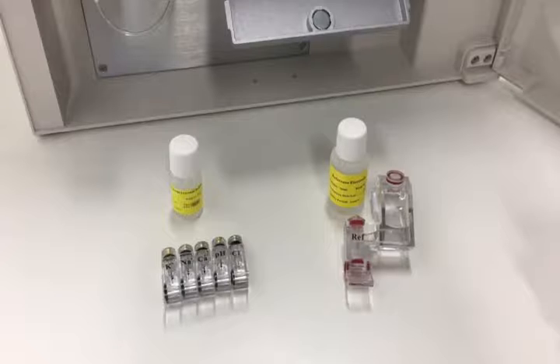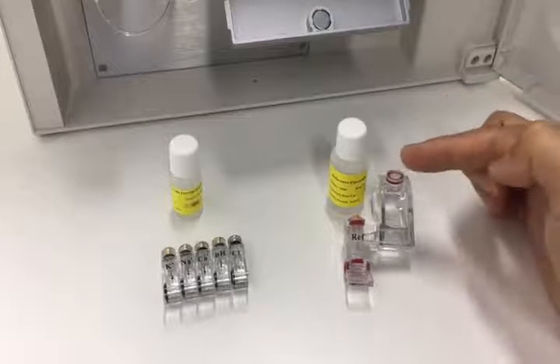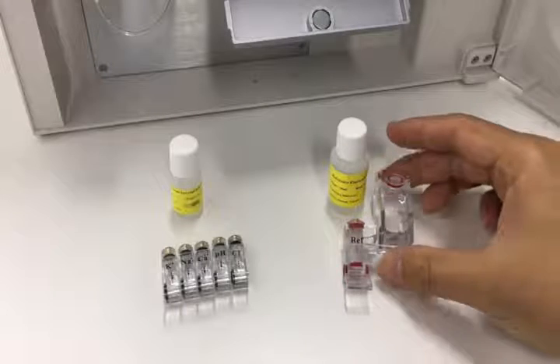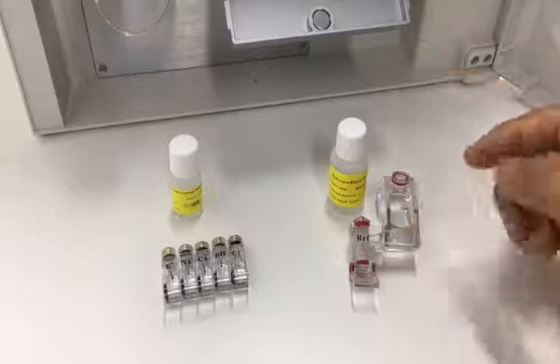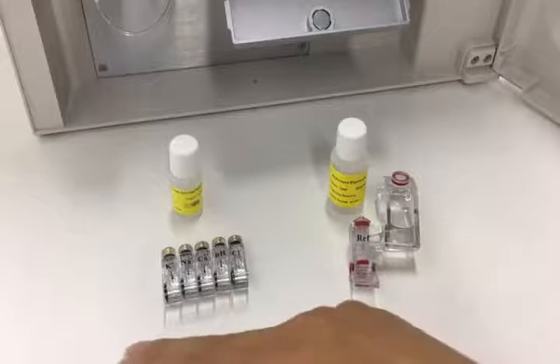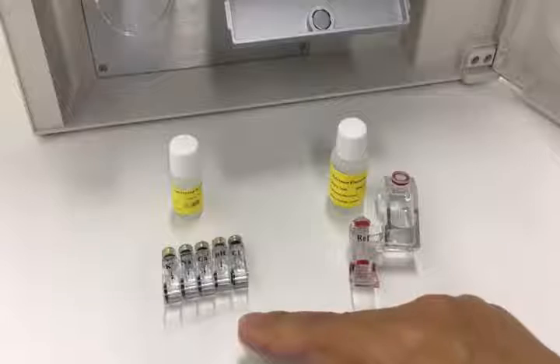There are two kinds of electrode solution. The reference electrode solution is special for rough electrodes. And the smaller one is generic for all the smaller electrodes.